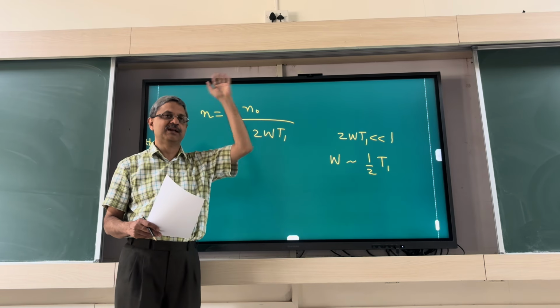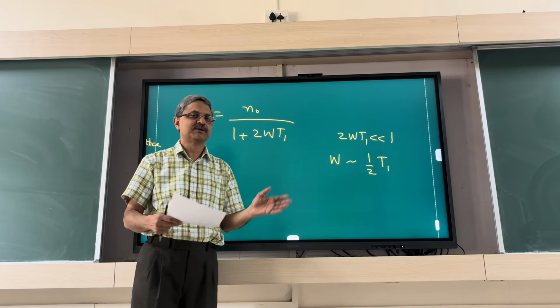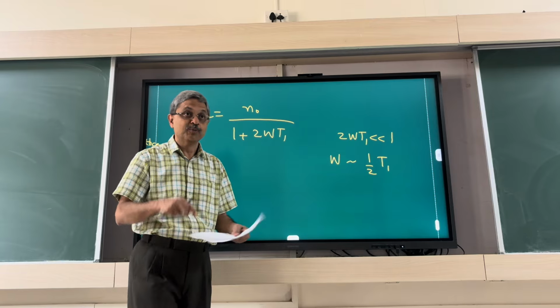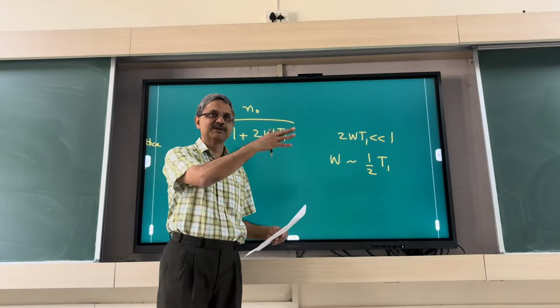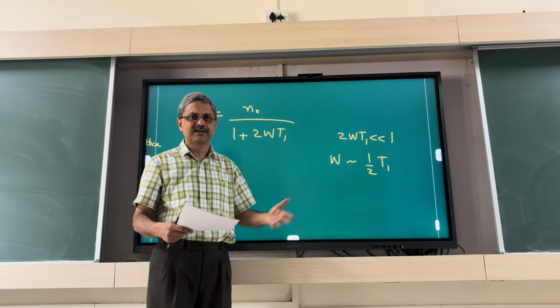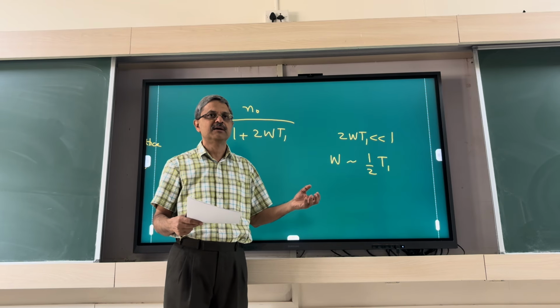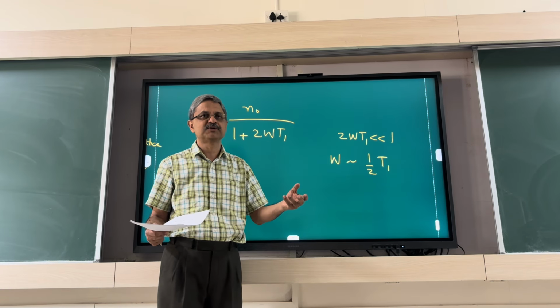Originally when NMR was discovered, this was one of the challenges. Some people were lucky and used samples where there was sufficient coupling, so you could get a population difference. To magnetize a sample for nuclear moments, to create a population difference, you need a T1. You need a bath. If they're not talking with each other, the population will remain equal, and there is no question of doing NMR. You need a population difference to start with.